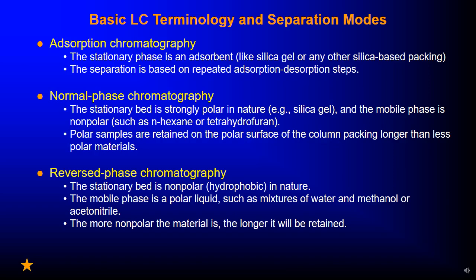We have adsorption chromatography, where the stationary phase is an adsorbent, for example silica gel or any other silica-based packing. The separation is based on repeated adsorption-desorption steps.